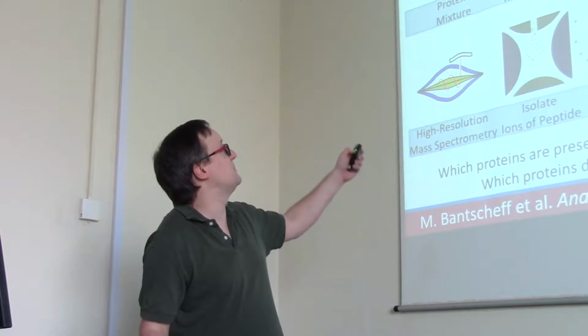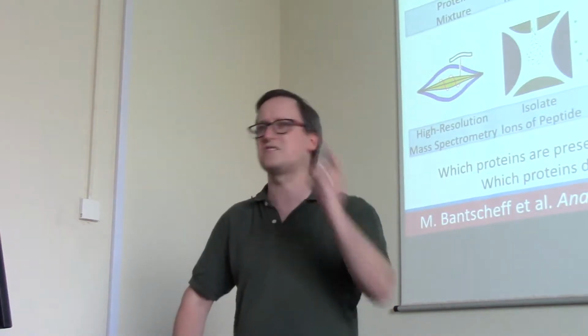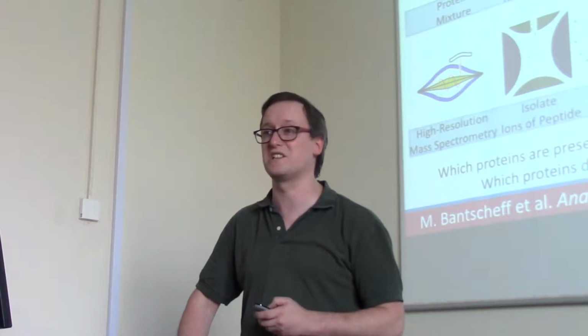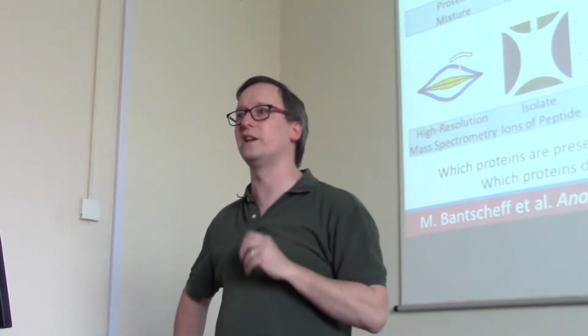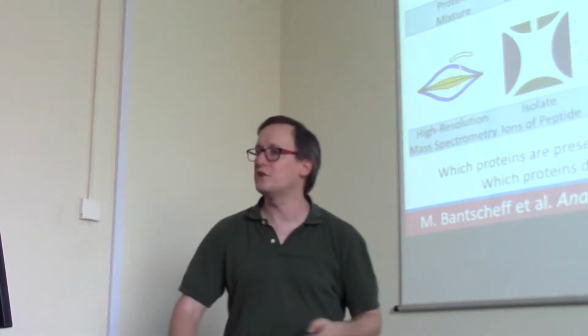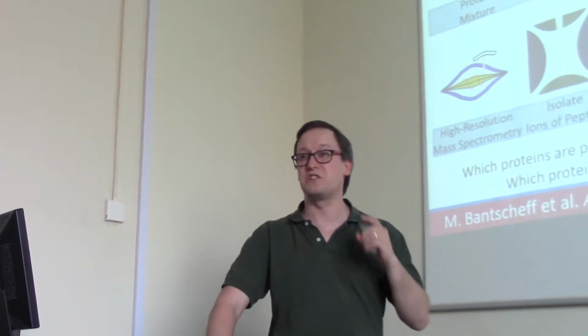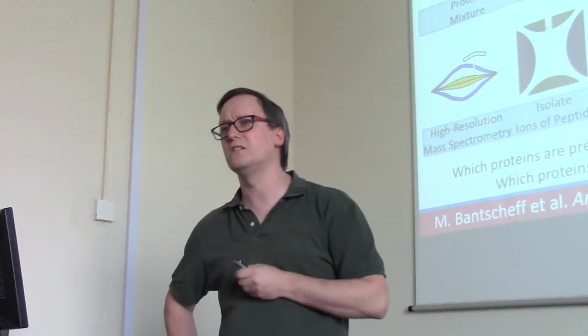So if I've got these 10,000 proteins, it doesn't necessarily make a lot of sense that in the very next step, I would digest all of those up. But that's exactly what we do in most shotgun proteomics experiments. I've called this discovery proteomics. Another nickname for it is shotgun proteomics. So you can imagine that these 10,000 proteins have been digested with trypsin. Trypsin doesn't just cut randomly. Where does trypsin cut?